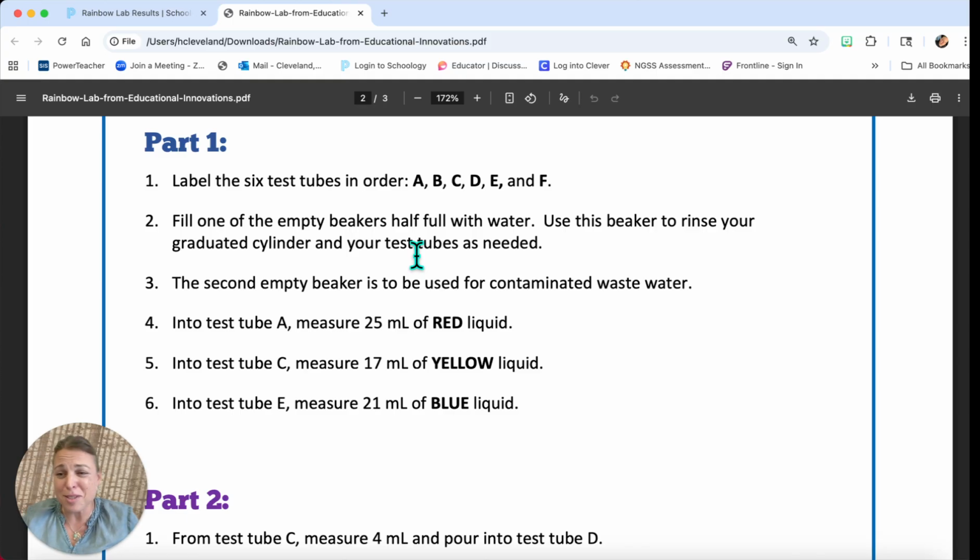One other thing I wanted to mention, I set up the water ahead of time and I found to truly make the rainbow, you really want to have your red water rather pinkish light color, because if it's too dark, when you reach the purple step, it turns into more of a brown than a violet color. So a light pink on there. Hope this helps.